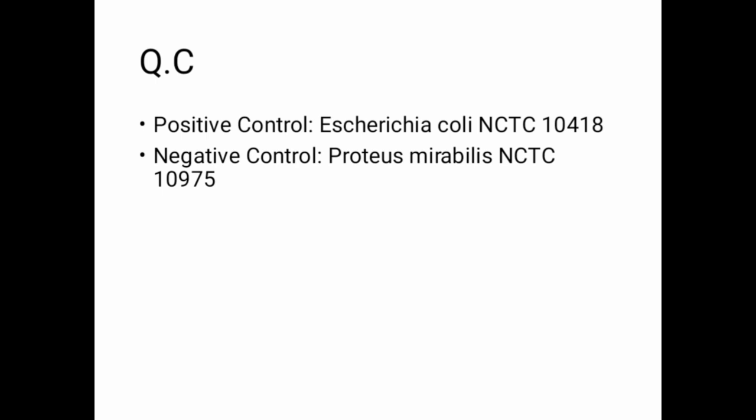Quality control. In the indole test, we use a positive control and a negative control. The positive control is E. coli NCTC 10418, and the negative control is Proteus mirabilis NCTC 10975. The control is used for every single test, because with this control we assure our result.